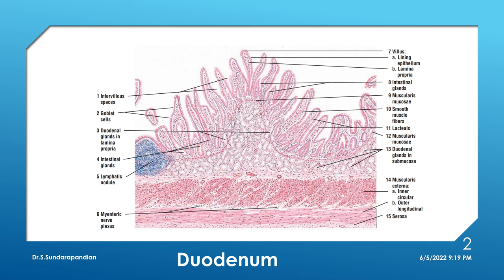Another projection you can make out here — this includes submucosa also — is called plica circularis. That is the permanent mucosal fold present in the small intestine that increases the surface area. So the modifications in small intestine to increase surface area are: plica circularis and the surface projections called villi.